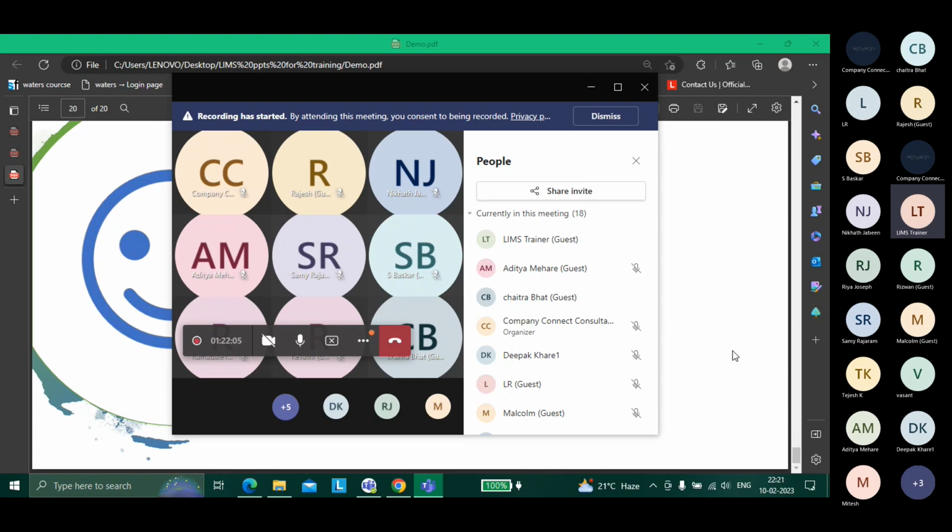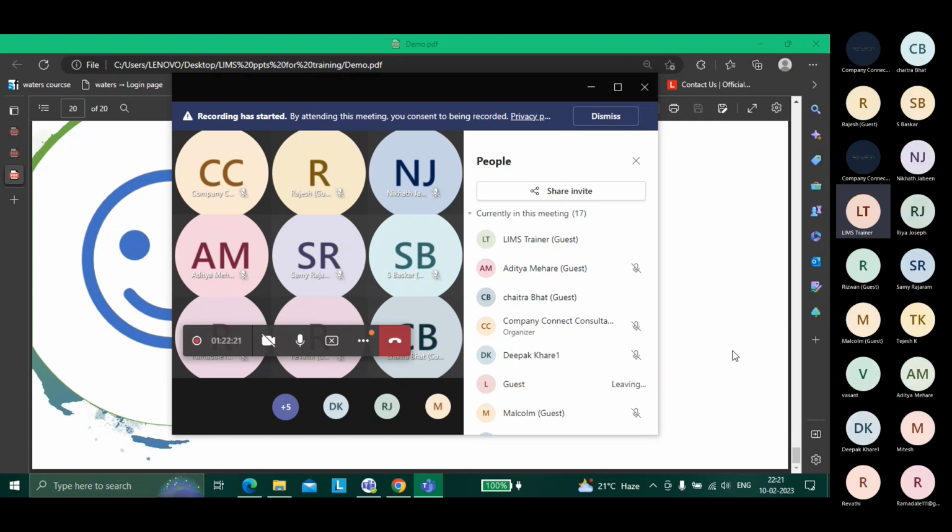Even the developers who are creating, they are studying, they are testing, and then they are creating. Same for master data, right? You are working on some dissolution, creating some dissolution analysis, creating subroutines for dissolution. Stage 1 is failing. Stage 2 components are getting populated. Stage 2 values are out of specification. Stage 3 values are getting populated. You are testing, you are creating the code. Maybe it's failing at some point. Again, you are modifying the code. You are testing. You are using so many functions. Client is testing it. Then that is coming into picture.